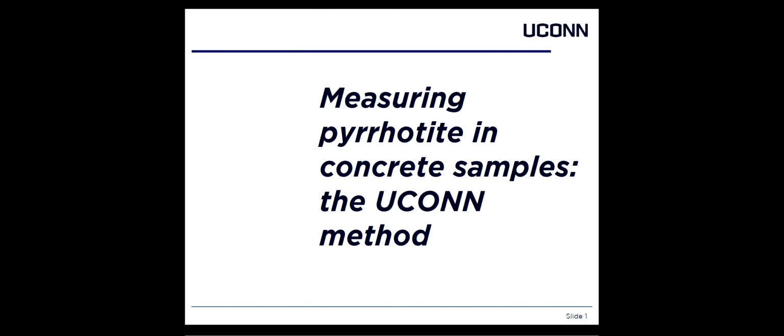The UConn Crumbling Foundation research team presents a basic introduction to the method we have developed for sampling and analyzing concrete samples to determine the presence of pyrrhotite. Additional details can be found in the journal publication posted on our website.